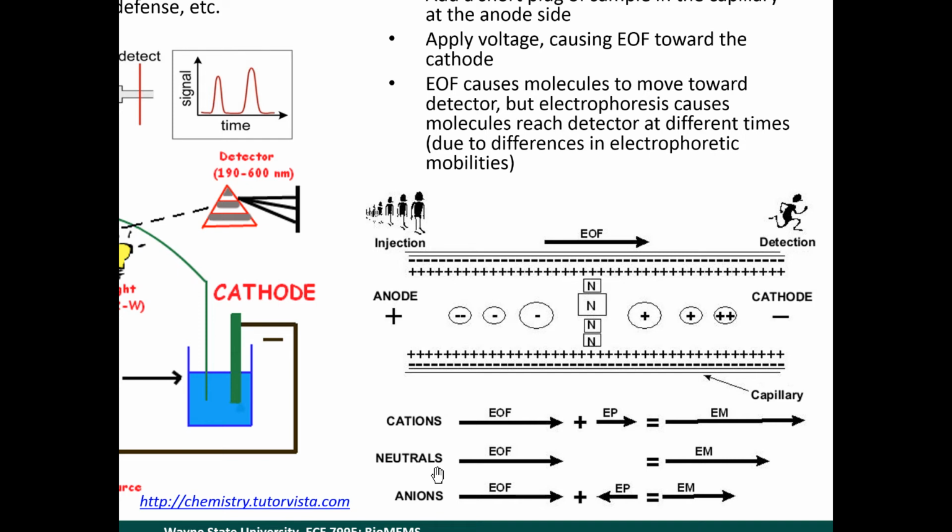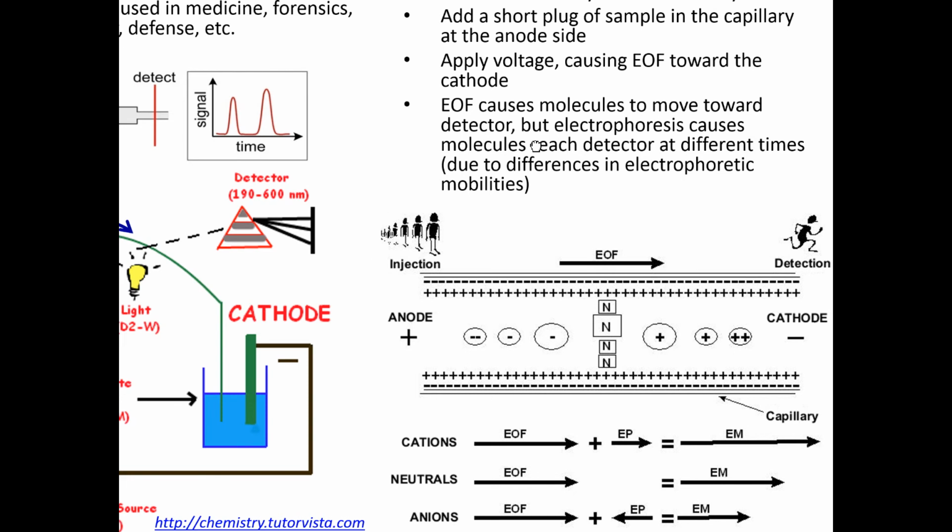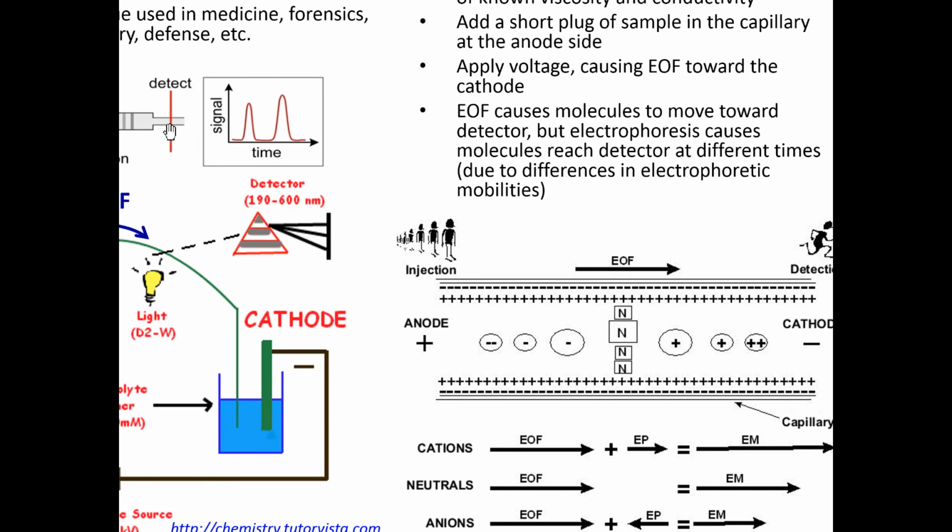So these different molecules come out at different times, and the detector monitors them. The DNA molecules, if they're fluorescently labeled, you can monitor with a fluorescent detector. It is even possible to monitor certain molecules with just an absorbance detector, although it can be difficult because the path length is very short. If you're trying to optically detect a molecule, it doesn't work very well at the small scale. That's something we'll talk about more in the detection module.